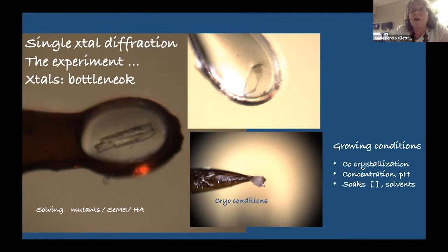There's another crystal there sticking out a little bit in a mass of ice, because they will survive longer in the beam. These crystals have a lot of water, and then you just blast them with the intense beam. So basically, you are going to destroy your sample.